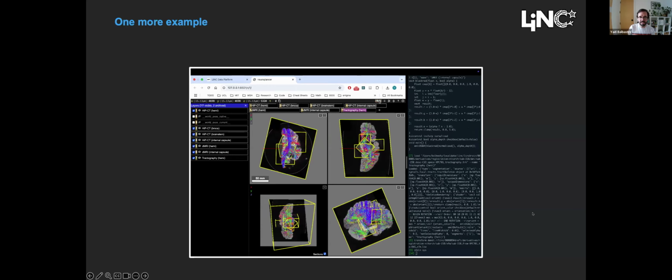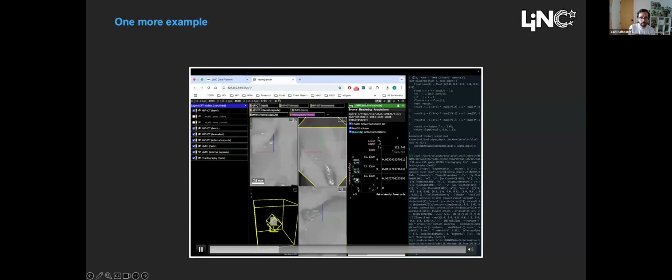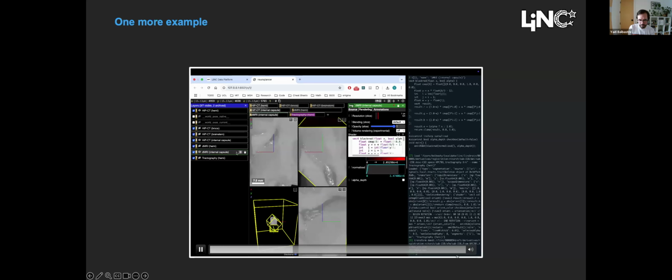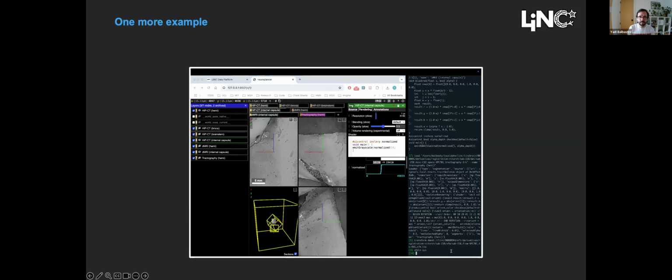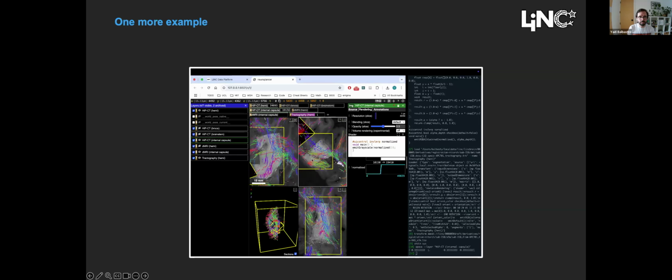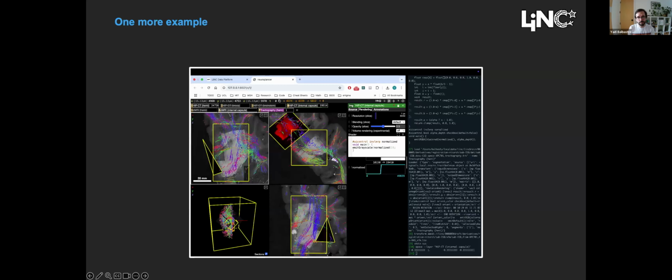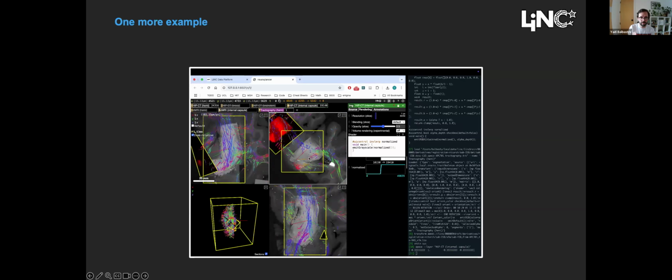And then that's just a classic neuroimaging interaction where we have all different layers, and people who are used to Neuroglancer just do that stuff. But what I'll show later is that we can also keep interacting with that scene. For example, when you have all of these layers acquired with different orientations, we might want to look at the data in a frame that is aligned with the voxel space of a given layer.